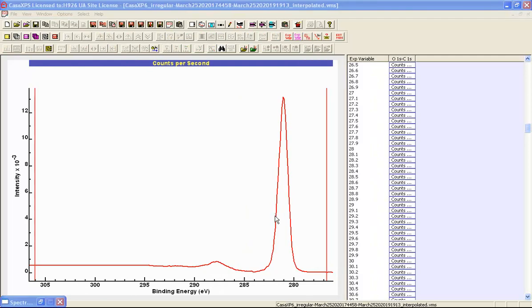The difference between this polystyrene that we see here and the previous polystyrene that I used in the depth profile is that this one is representative of polystyrene at the end of this profile sequence. And the task is then to save this as a VAMAS block that we can use in a least squares calculation, and then find the corresponding PVP spectrum that we can use to represent PVP at the end of the profile.